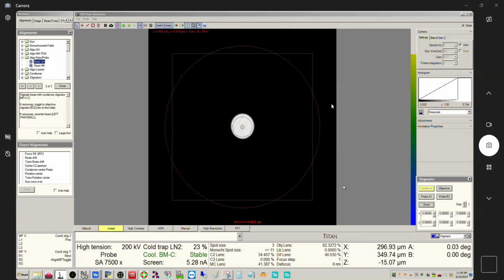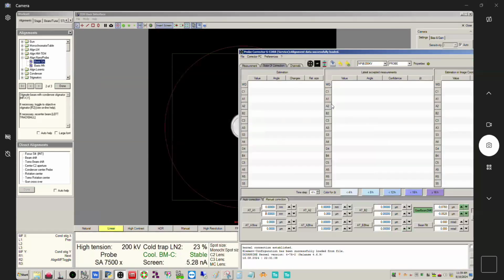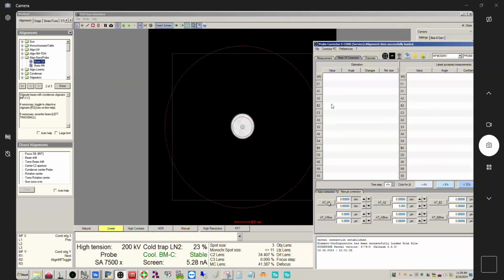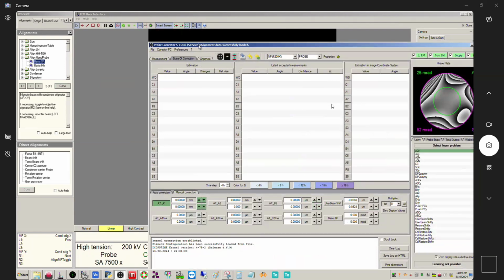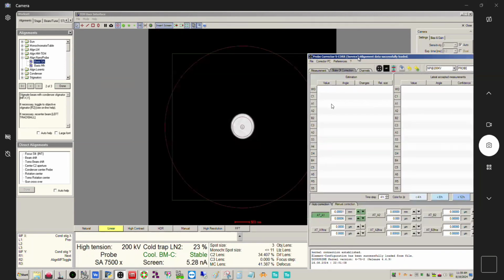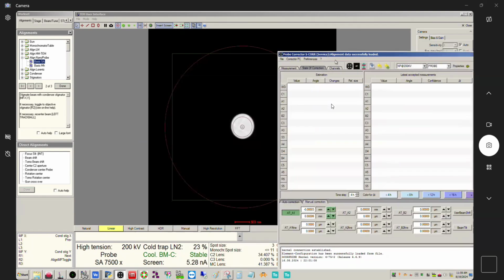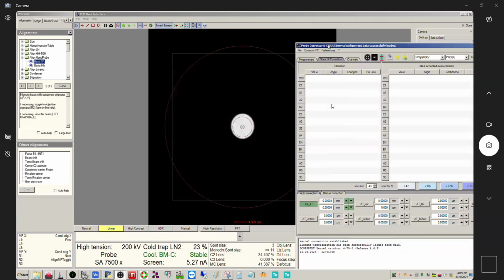All right, it looks reasonable right now. What we would want here is to use ATA1. This is coarse. Again, you use bit multiplier 0 here for this. Can't tell if it's doing anything. Is it? Yeah, it is. Let me see if I bump this up, if it does anything. If I bump it to 3, you can see it's making it more elongated.